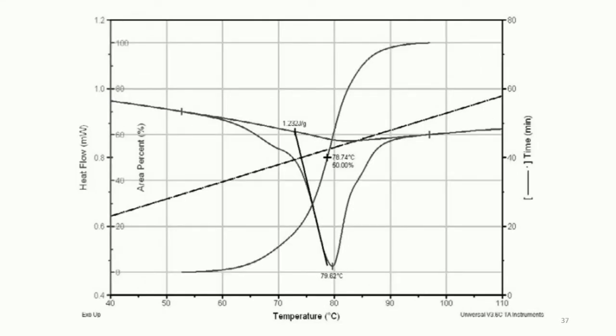In this figure, the 10% concentration data is shown with the sigmoidal baseline, and percent denaturation is plotted as a function of temperature.